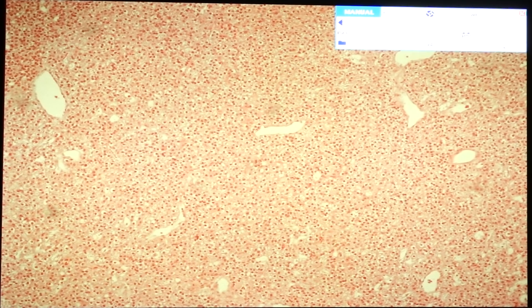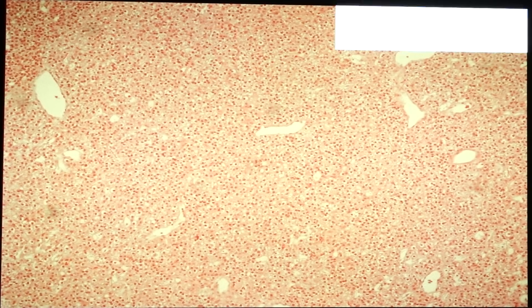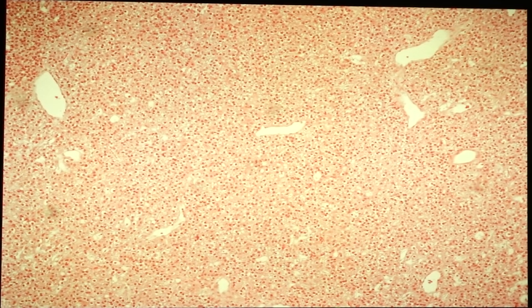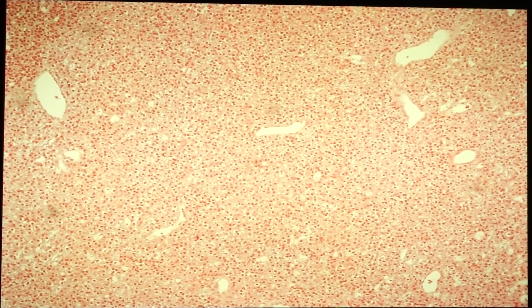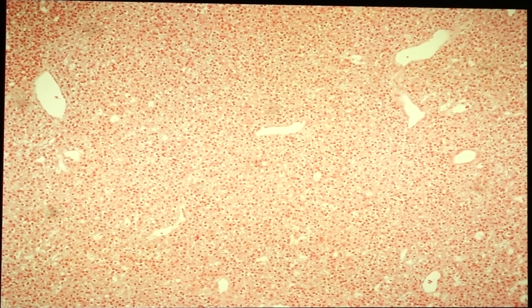Let's start with slide 45 — parathyroid hyperplasia. This can be primary, caused by primary hyperparathyroidism such as sporadic cases or as part of MEN syndrome, or secondary, caused by secondary hyperparathyroidism wherein there would be hypocalcemia.